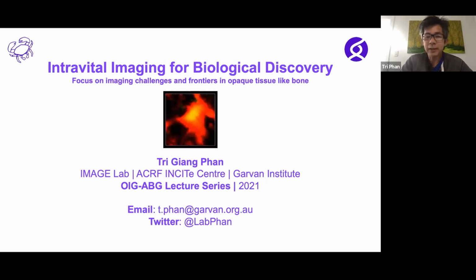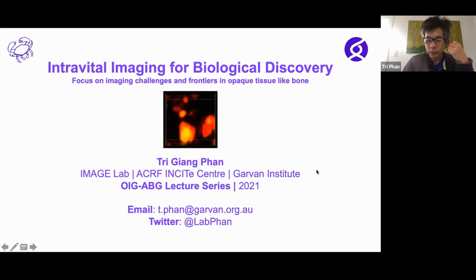So as Steve says, today I'm going to be focusing on some of our work in bone, but mostly I just want to bring out some of the challenges that we faced trying to do intravital imaging in bone, and highlight some of the things that I think we could have done better, and hopefully get ideas from the audience in terms of how we can do things better in the future.